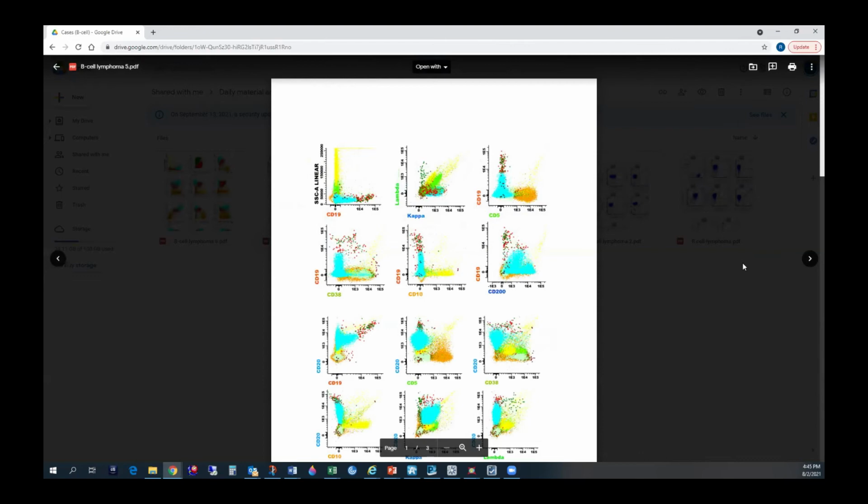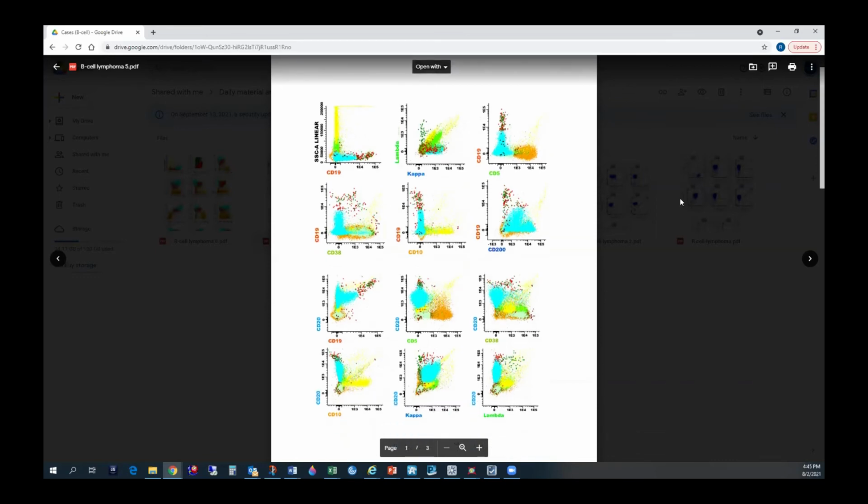I'm not used to this plot actually, so it took me a long while to understand which population I am targeting. Exactly, that is what takes time when you start initially, and if your tech doesn't clean up the background. Oh my God. And then there is a problem with this, like there is a 38. One of the plots is 38 positive, another is 38 negative. That makes such a difference in my thinking. That gives you the clue actually, Shweta. But I was telling the experience at MSK. Oh my God, they are such busy plots, and they notice like 3 or 4 dots, and they start enlarging those 3 or 4 dots, and then I start losing my mind.